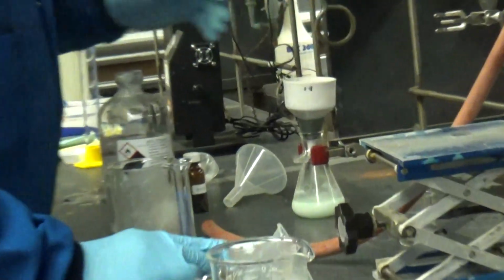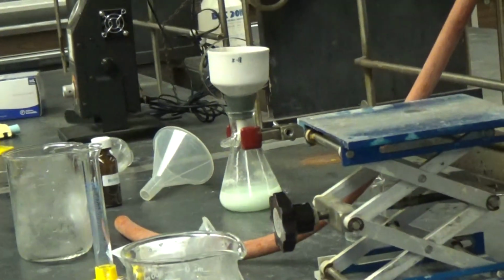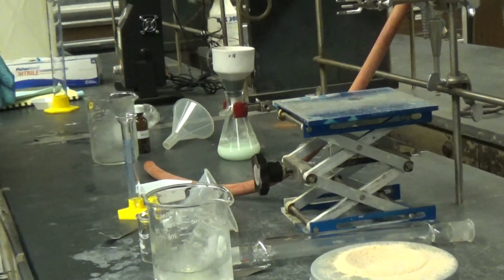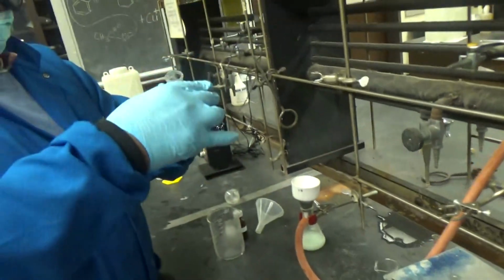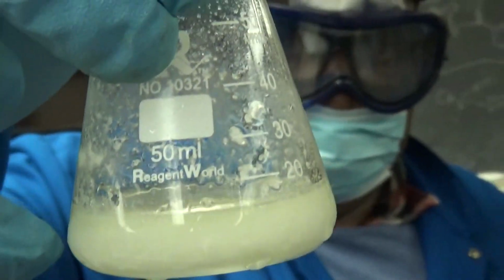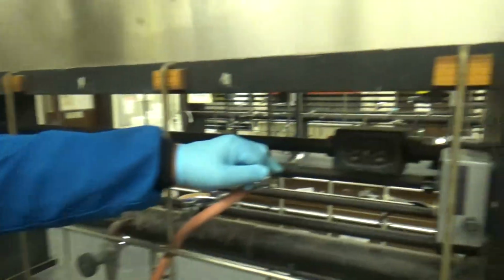Now it looks like you're just going to use the same flask as before for waste, and then you'll get a purified product on a new filter paper. So we're getting ready for another vacuum filtration of your purified product. We have a fresh paper. Let's take a look. That's what appears to be tons of your purified recrystallized material. You know the vacuum is working.